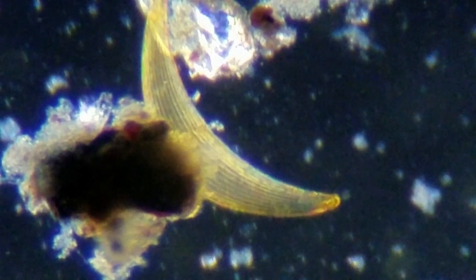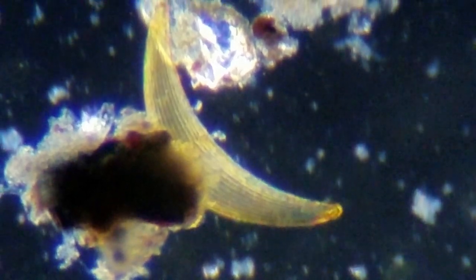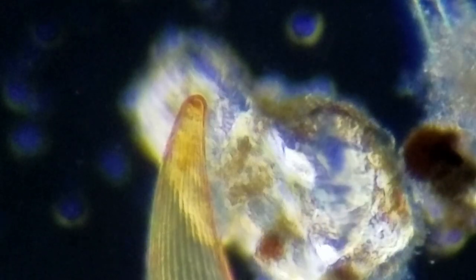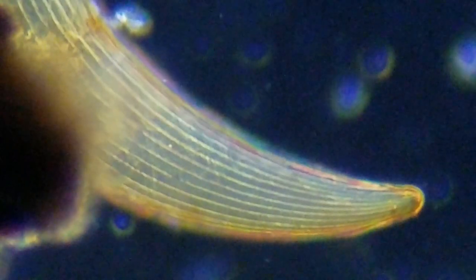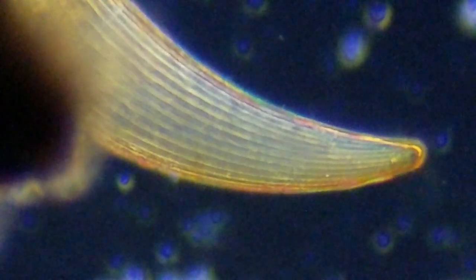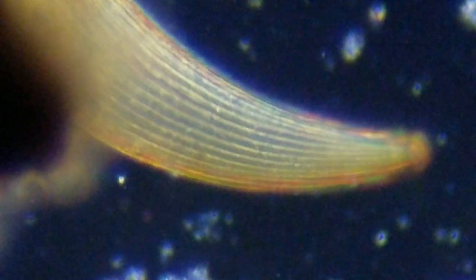Let's look at it at 250 power — we're at 100 power, so going to 250. And look how bright she is. Actually, it's right in front of what I think is a pebble in the back, that crystal-looking thing. So it's right in front of it, which is good. And this is algae right here covering part of it. We should be able to see some living organisms inside of this. We're kind of scanning right here through it.